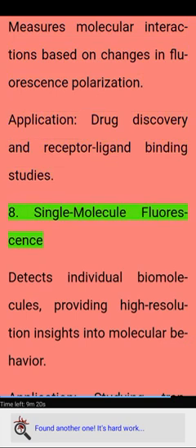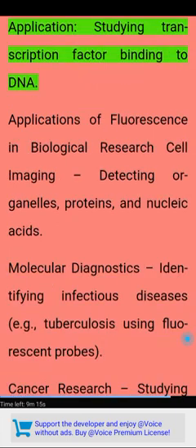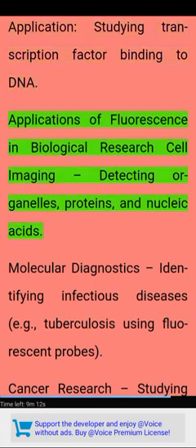8. Single molecule fluorescence detects individual biomolecules, providing high-resolution insights into molecular behavior. Application: studying transcription factor binding to DNA. Applications of fluorescence in biological research: cell imaging, detecting organelles, proteins, and nucleic acids.